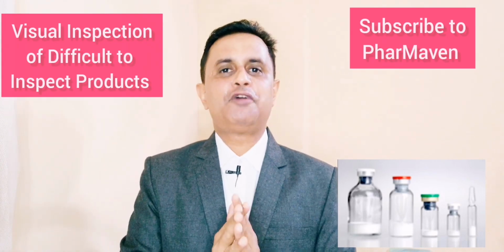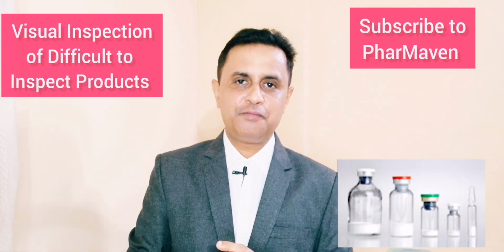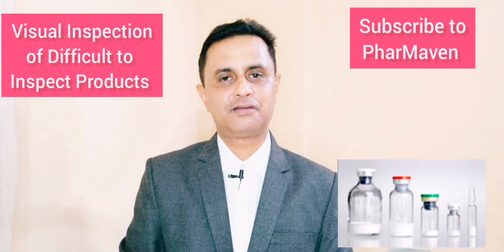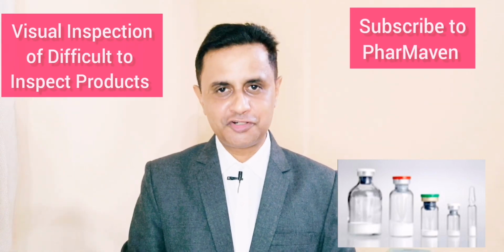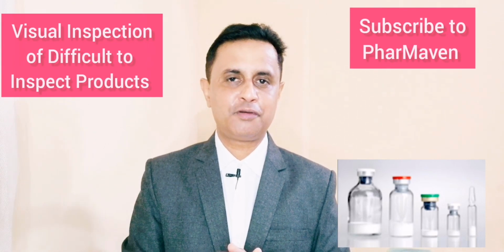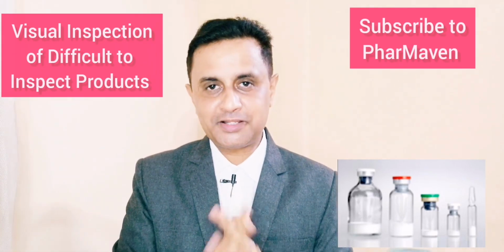If there are no abnormalities, we can say we do not have much problem with the product. But if you find certain deformities, certain rejections, you can increase the number of sampled containers. You can decide on more vials or containers to be collected, reconstituted and inspected. And on that basis, a decision has to be made whether we have a problem or not with the batch. So this is how we can inspect the lyophilized product.